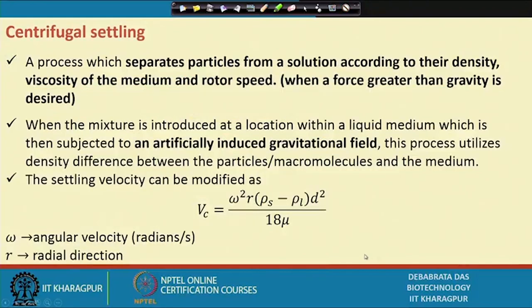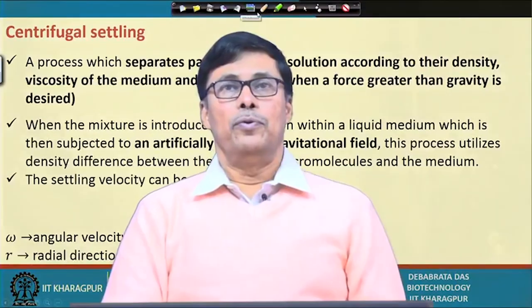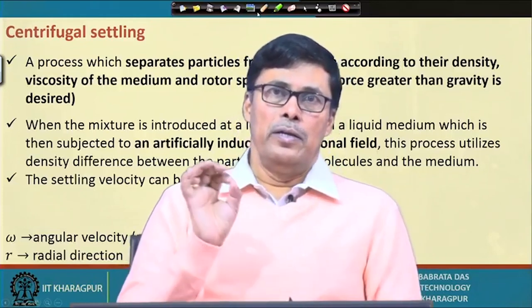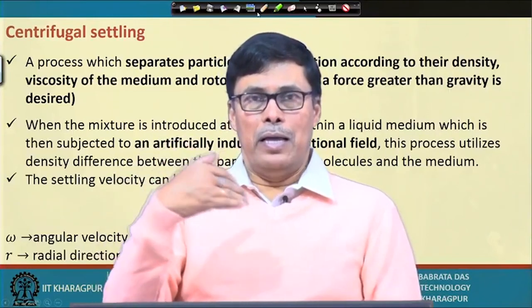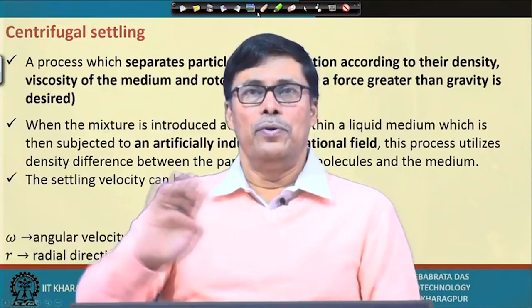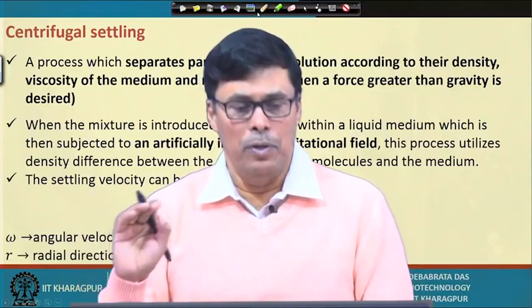Now, in the case of centrifugal settling, we have two types of forces acting on it. One is centrifugal and then centripetal. Centripetal acts towards the center, and centrifugal is towards the periphery. So your solid particle is separated with the help of centrifugal force.